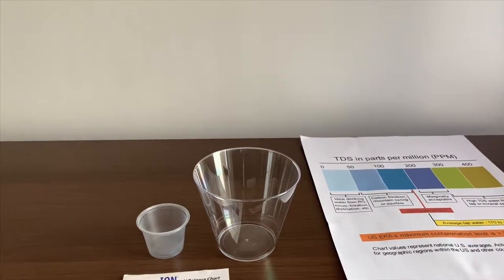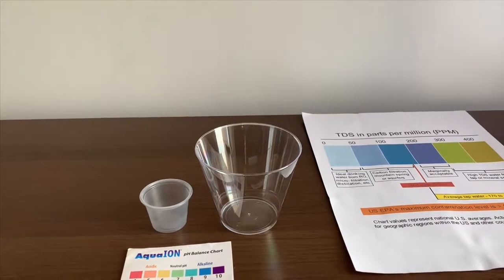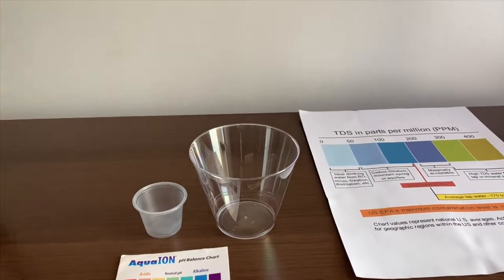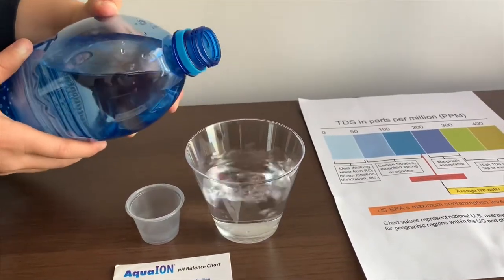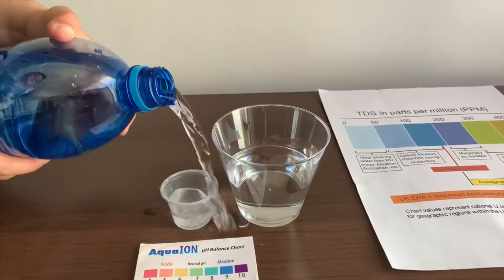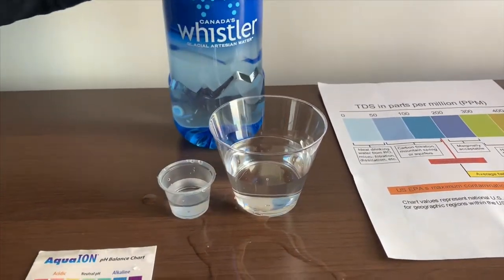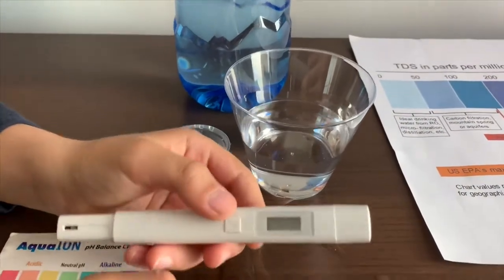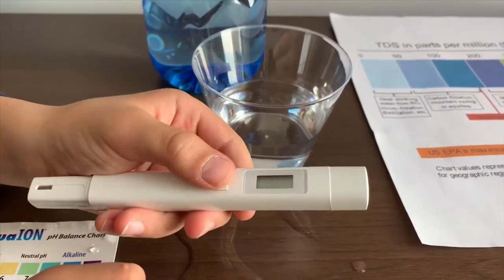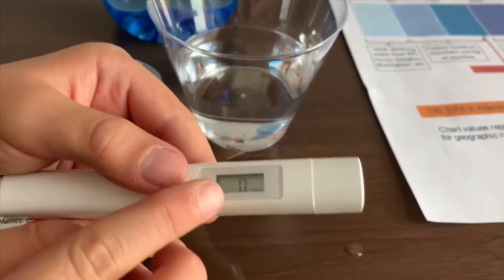It costs $2.09. Let's pour some water in. First we're going to test the TDS level. If you want to buy this TDS tester, check the link down below. Turn on the TDS tester, make sure it says 0 and put it in.